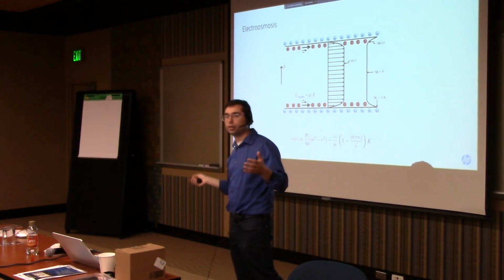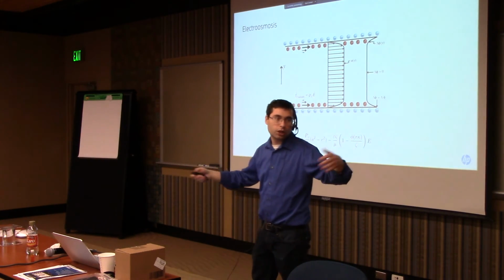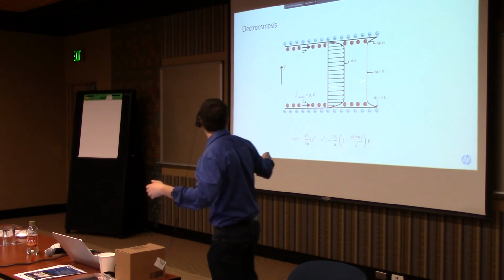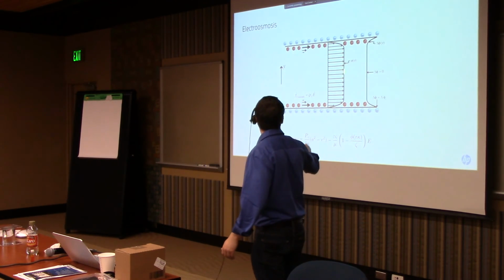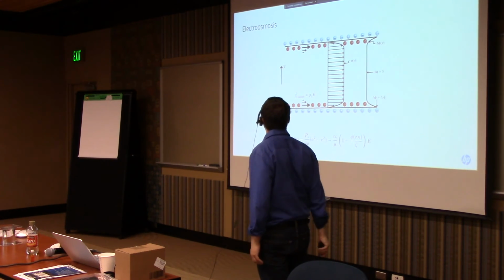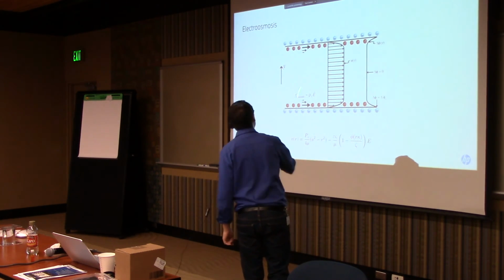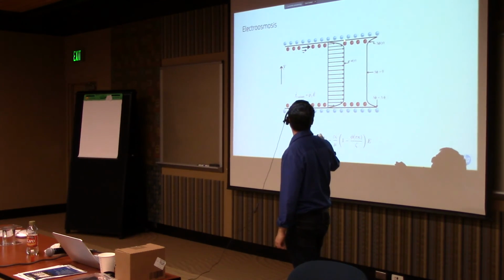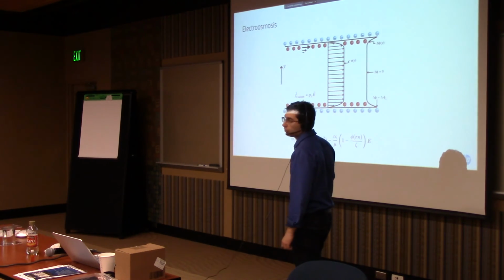It's incredibly thin. So the bulk, like you guys, would not even feel it. You feel like the walls are moving, and so you could just drive across. So this profile that's drawn here, this is the velocity profile of the water that will be moving, is actually quite exaggerated. It's almost going to be completely like a top hat distribution.